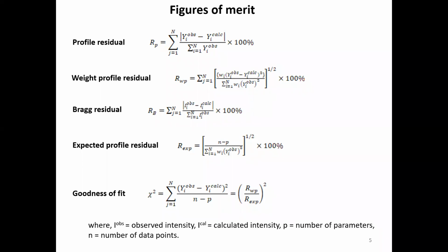I didn't get it. Can you please repeat? The numerator should go to 0 in a very idealistic case. Okay. And in the same case, we require that chi-square should be equal to 1. But because the numerator is 0, chi-square will be 0. Okay, so I think I have made some mistake.